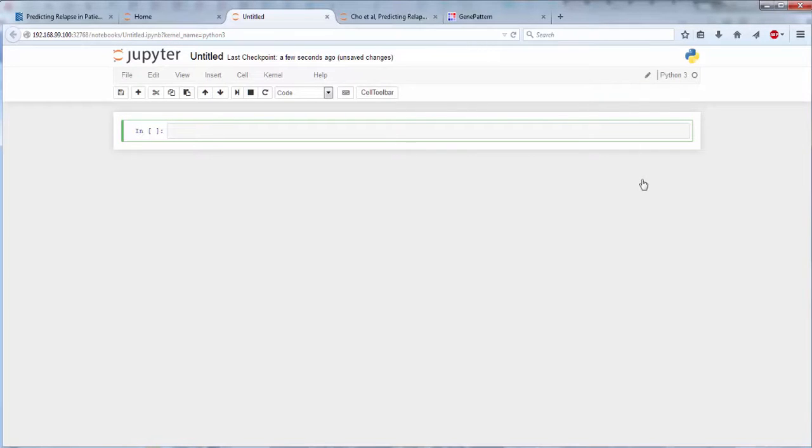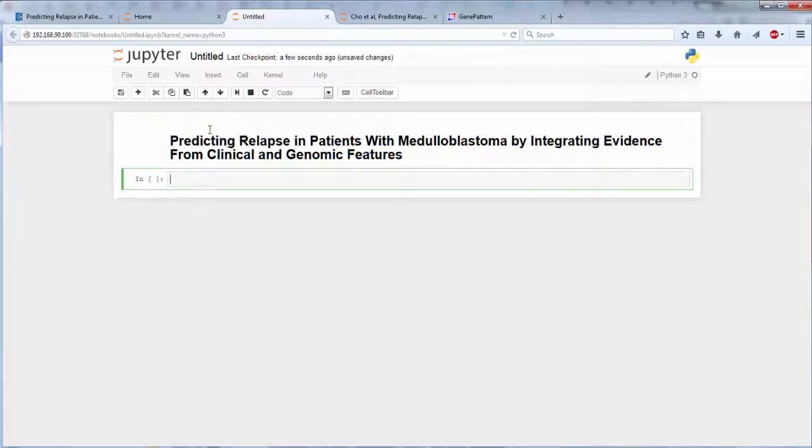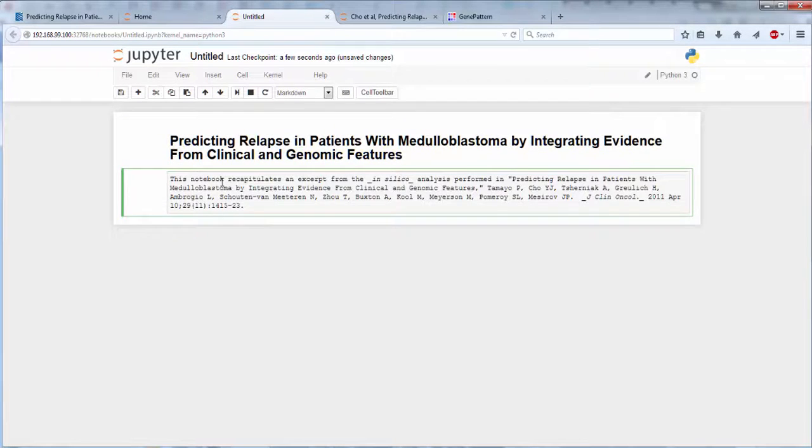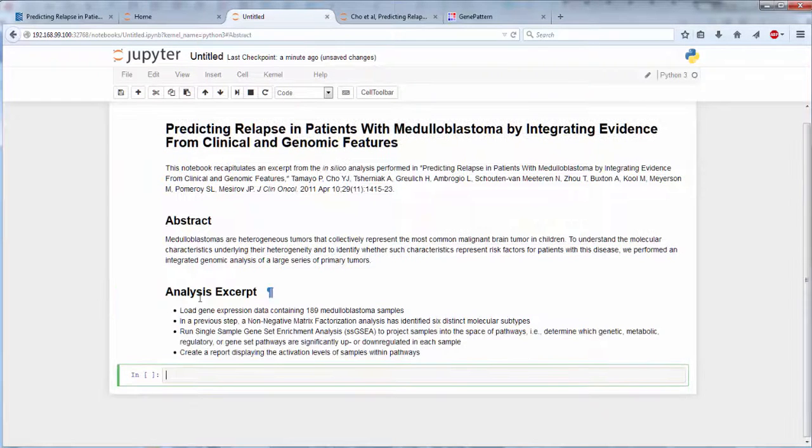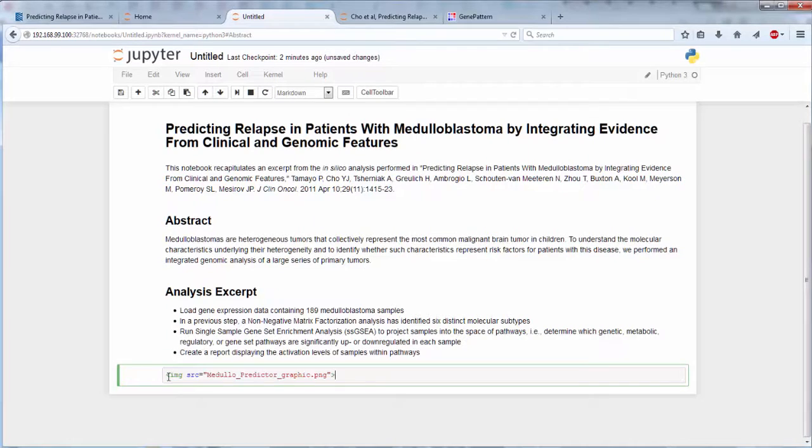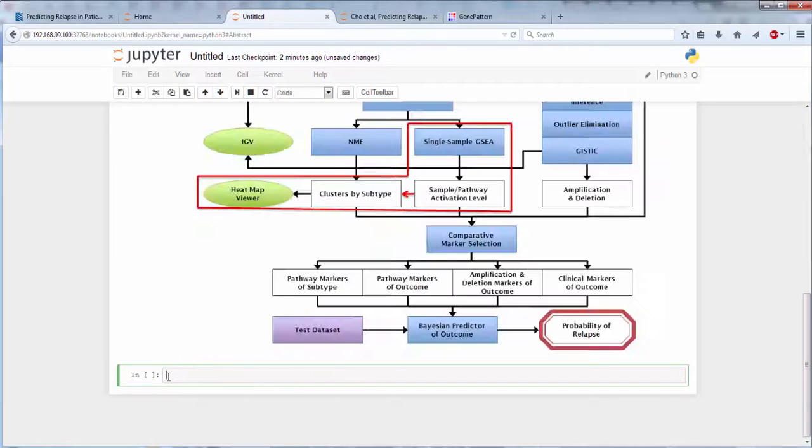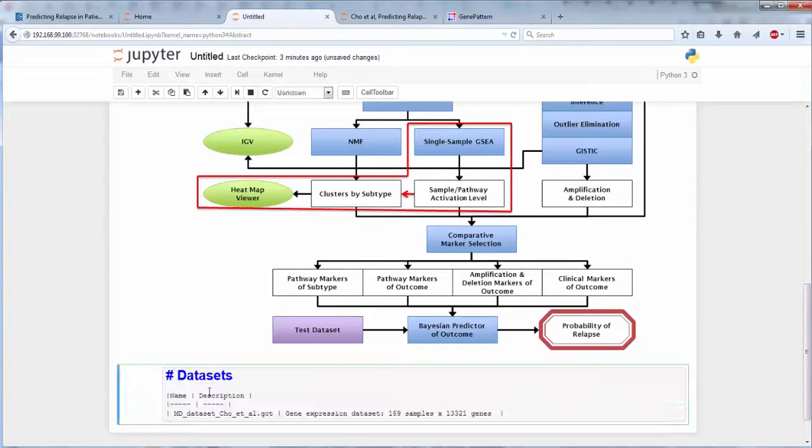In our new notebook, we add the title, description, abstract, and summary of the analytical steps, as well as graphics and table data.